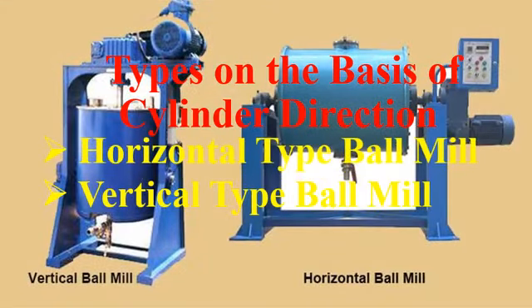So student, the seventh type of ball mill machine is known as the cylindrical type ball mill machine. Usually this ball mill machine is based on the shape of the ball mill drum, which is usually cylindrical.